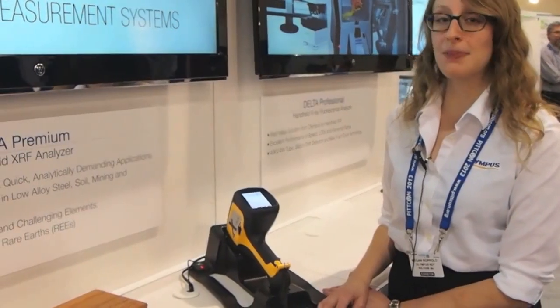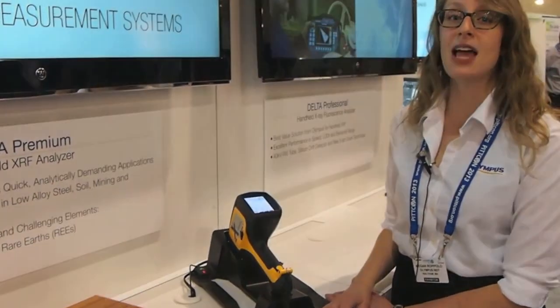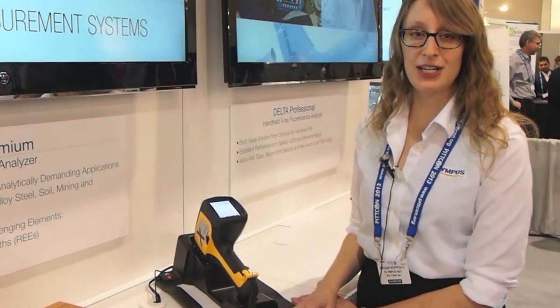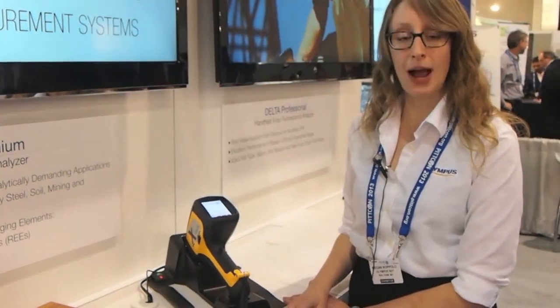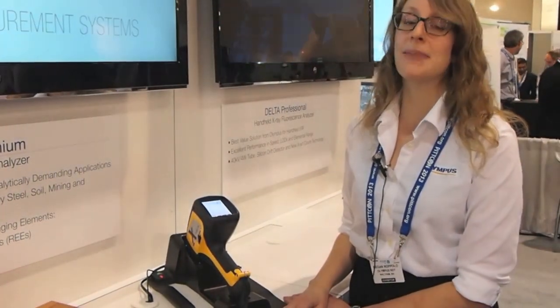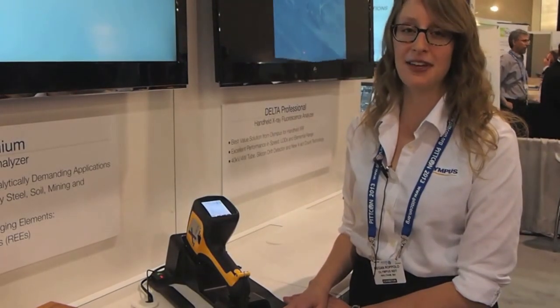So our most popular application is alloy identification, especially for scrap metal recycling and PMI or positive material identification.